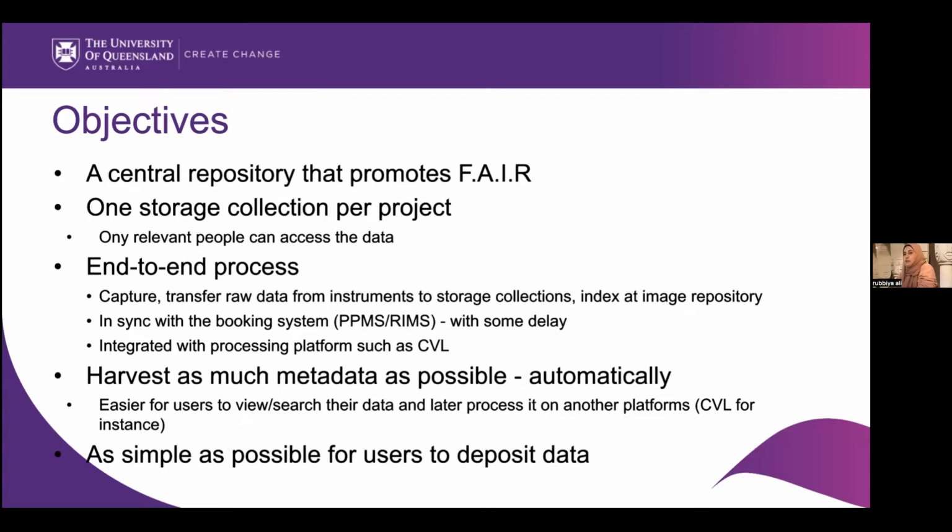So what we designed was, we tried to sync all this workflow with our booking system. In our case, it is PPMS, which is now RIMS. It contains all the metadata related to instruments, the sessions booked, and the projects, and the users, of course. So Pitschi basically starts by syncing all this data, and then goes to the next step.